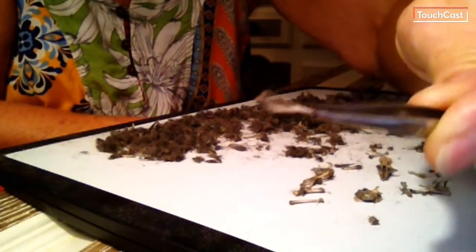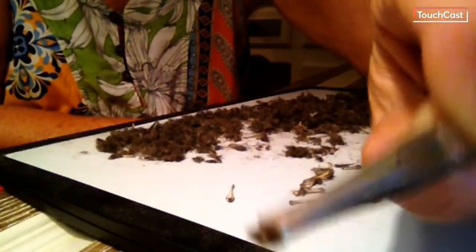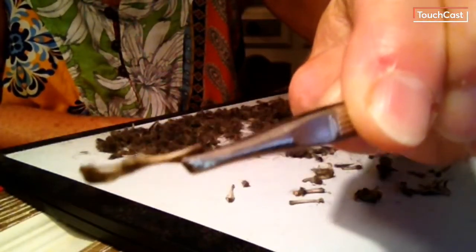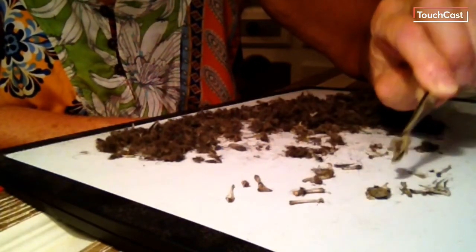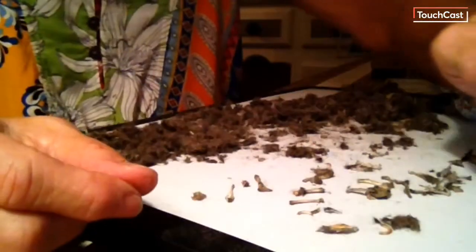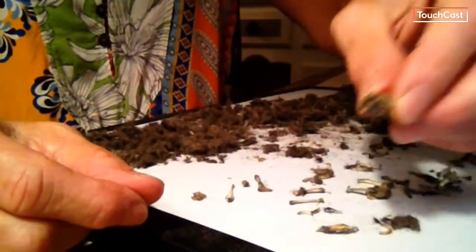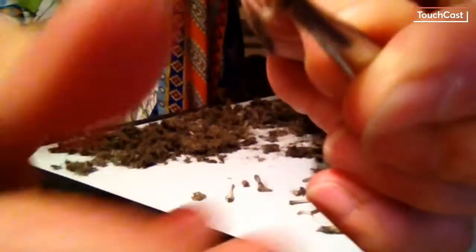We can see what kind of animal this owl caught. We can see that we have some kind of leg bone, a vertebra. We have all sorts of bones — we even have some partial skulls. Here is a skull; this one is missing its teeth because I already pulled them out. We can often tell that a skull is from a rodent. Here's a skull — you can see the eye sockets, but this one is missing its teeth. Here's a tooth — it's got some fur on it.